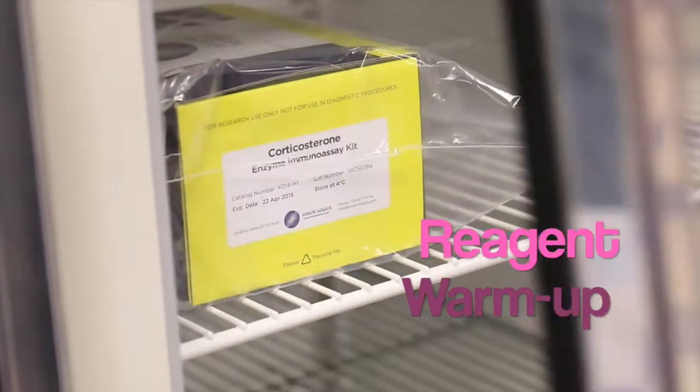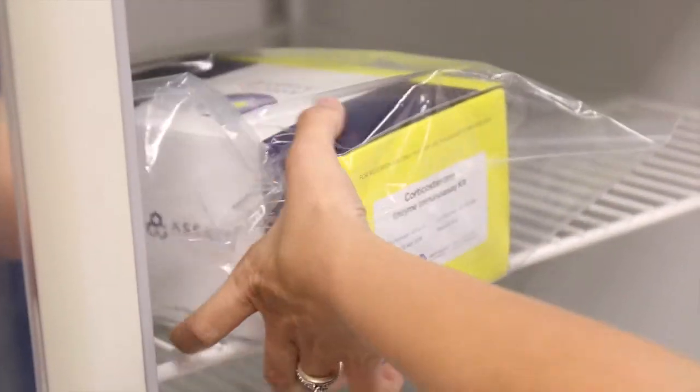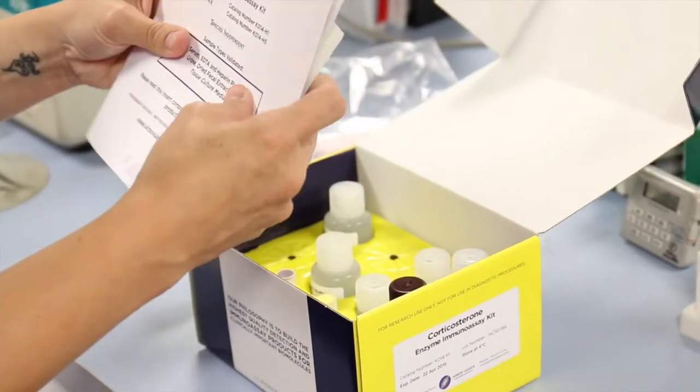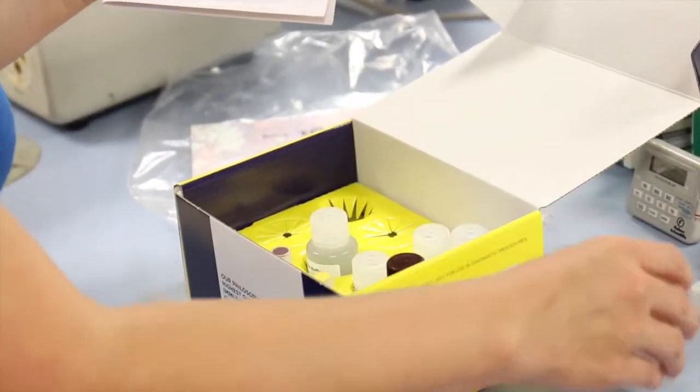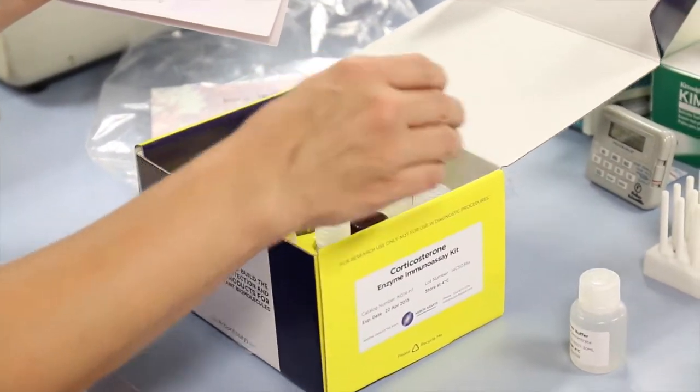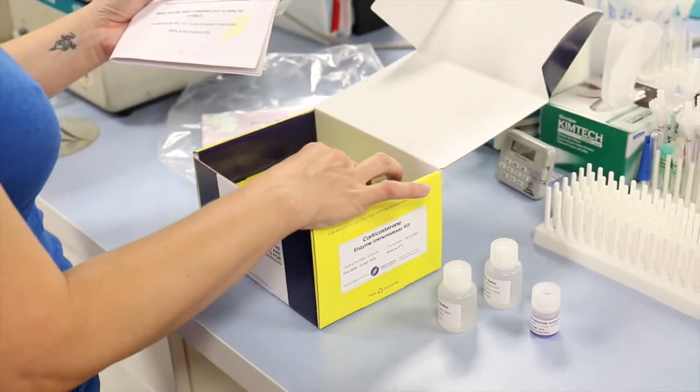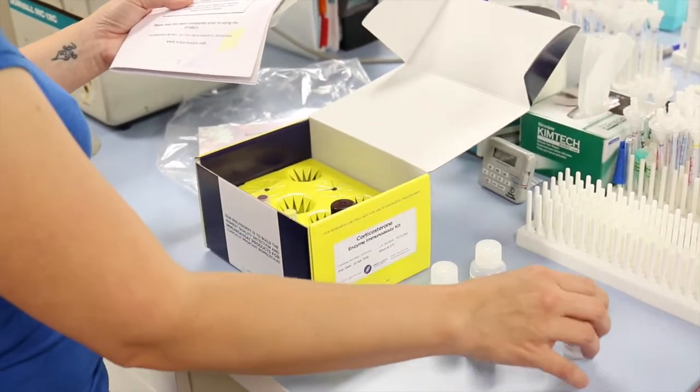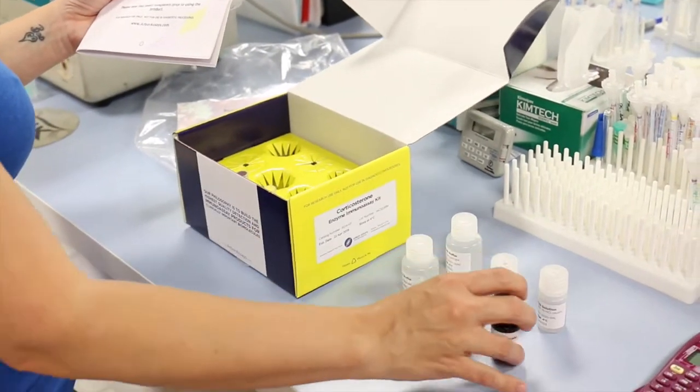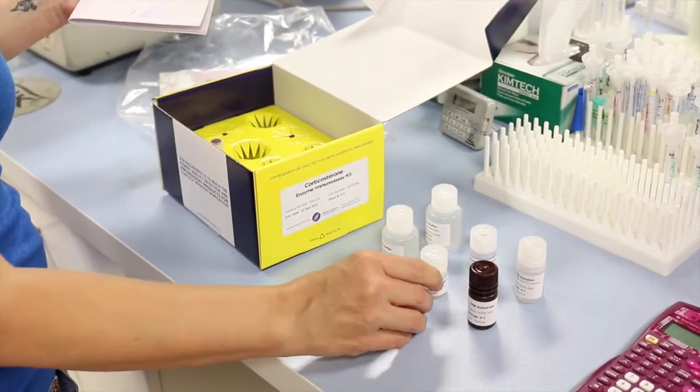For reagent warm-up, take the kit box out of the fridge or freezer. Unpack the kit box to let the reagents warm to room temperature. Note any precautions with thermally labile solutions, such as with our PKA activity kit KO27-H1.